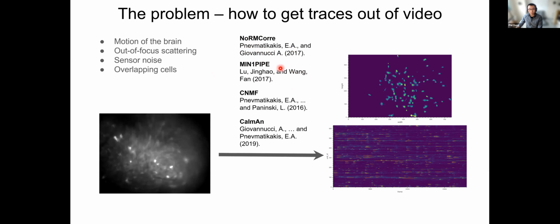But actually in practice, as Daniel mentioned, we face a new problem, and that is for a lot of us who don't have a strong computational background, these pipelines sometimes function like a black box. So you feed in your data, you let it run on the data, and then you get the traces out of it. It's really hard for us to get to know what's exactly going on behind the scenes and control how my data is being analyzed.